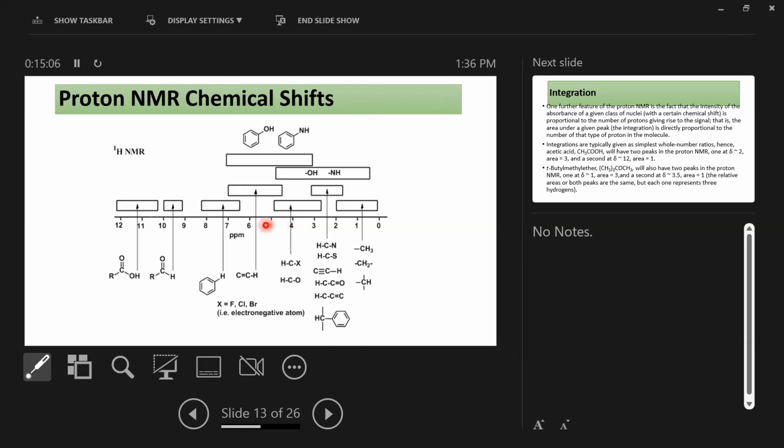For example, if you see a benzene ring and the chemical shift comes out of the 7 region and is closer to 6, like 6.5, 6.4, 6.8, what does that tell you about that ring? Remember, the typical area is between 7 and 8. If it moves to like 6.9, 6.8, what does that tell you about the benzene? It's shielded. So what type of group would be on it? An electron donating group would be weak or strong? Don't say weak. If it's coming out of the 7 going to the 6, it must be strong. So you're thinking about things like your amines, your alcohols.